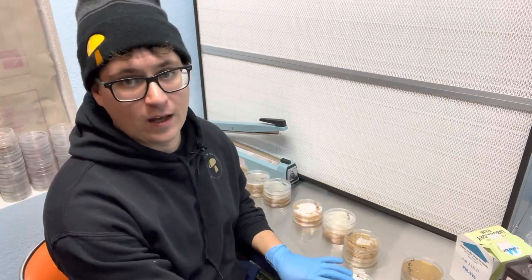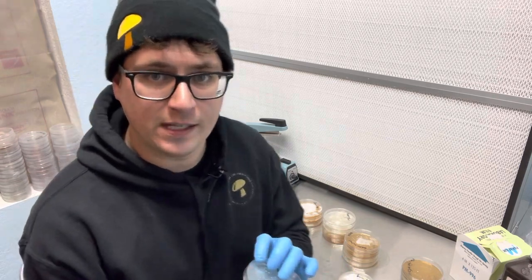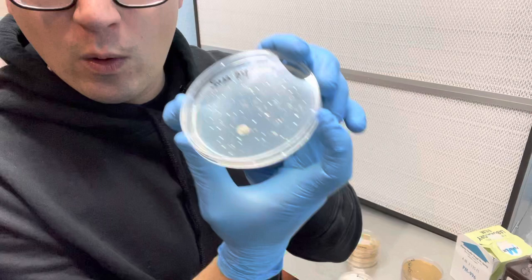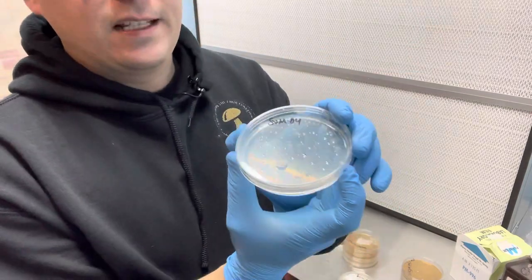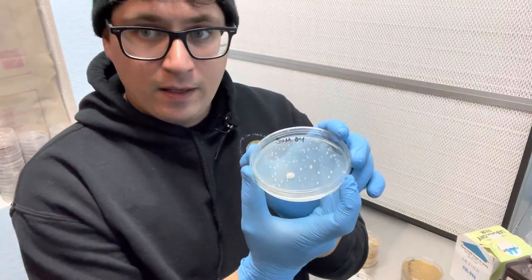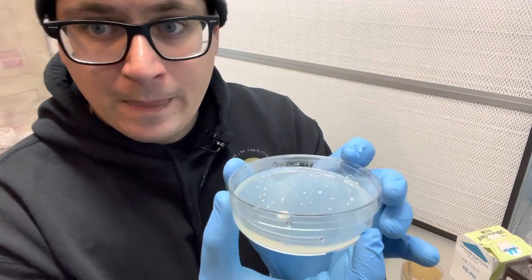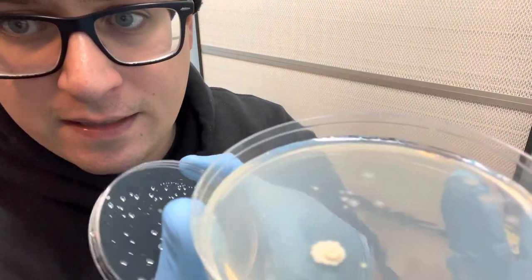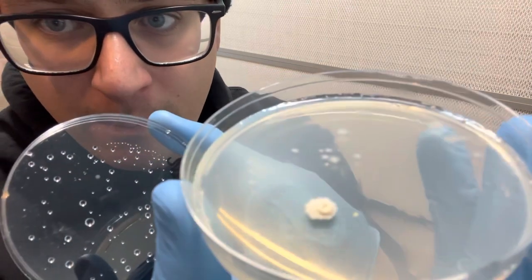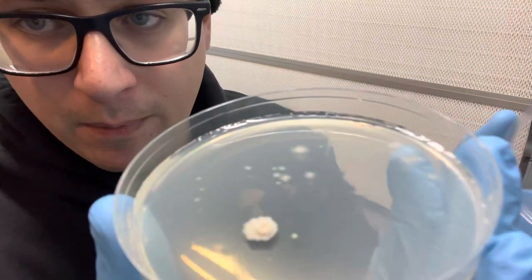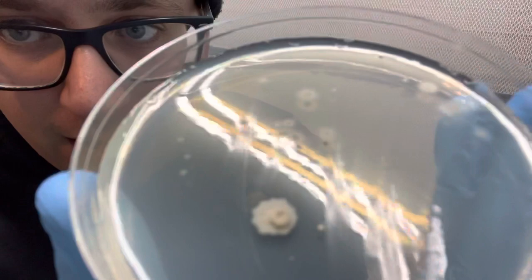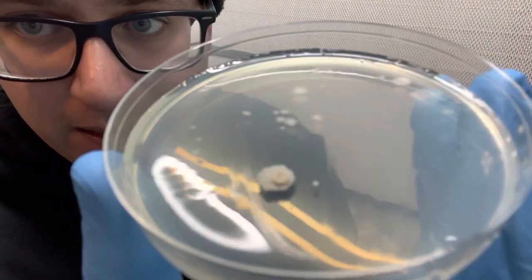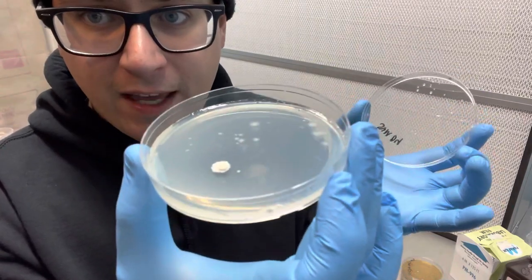First of all, I'll show you the difference between bacteria and mycelium. So this is an oyster petri dish, it's been inoculated for about 16 days now. You can see this dense colony here which some people might confuse for mycelium, but you can notice it's very dense. It doesn't have any filaments protruding out of that colony.